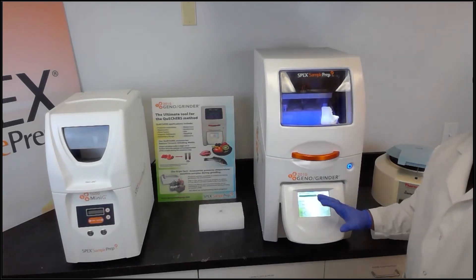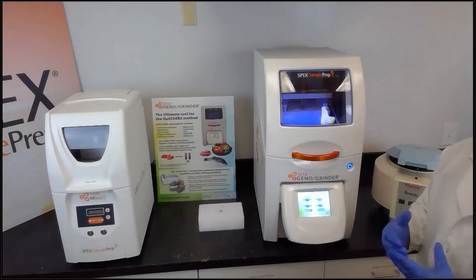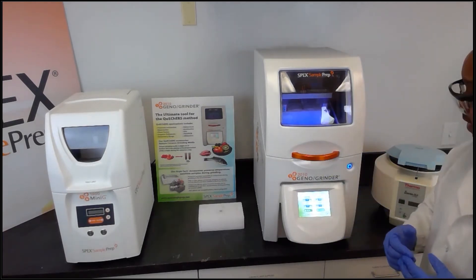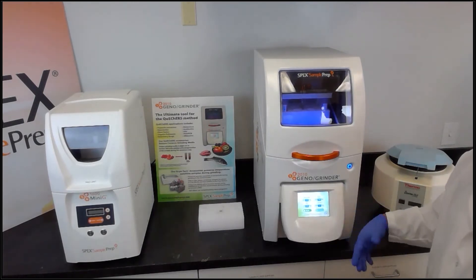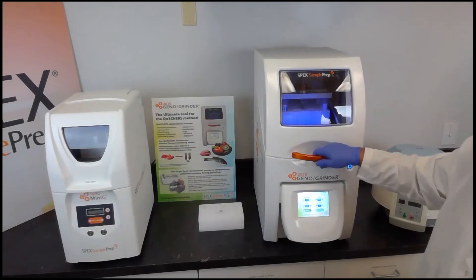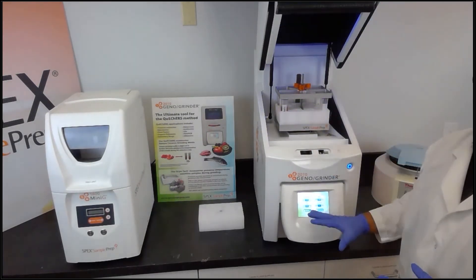With respect to time we're not going to complete the full cycle, and the unit does make some noise that may interfere with the audio. I've prepared samples ahead of time, so we'll simply move to removing the samples after the run is complete.